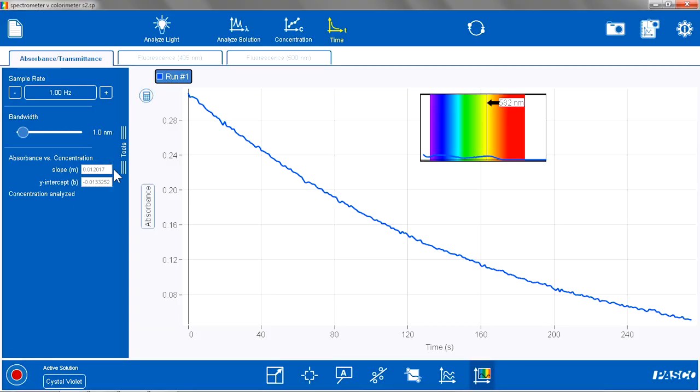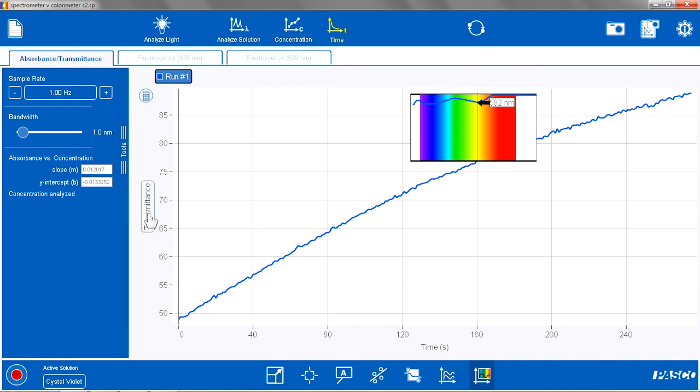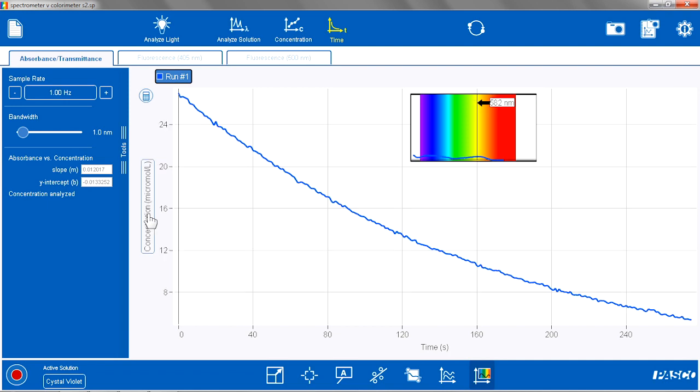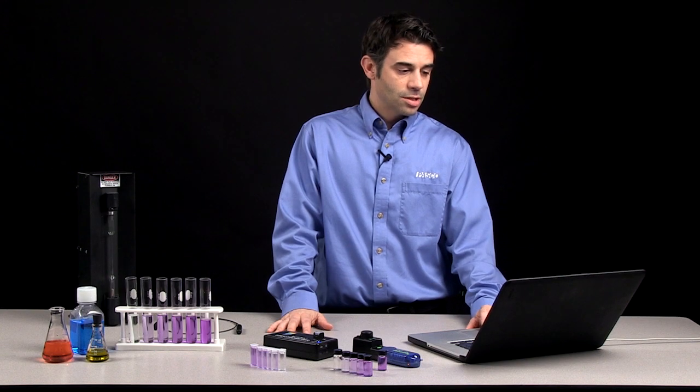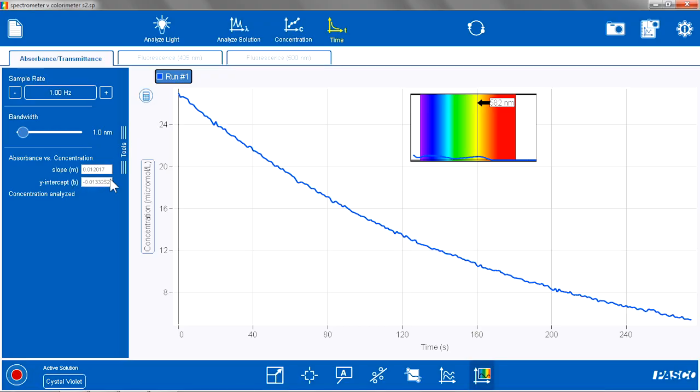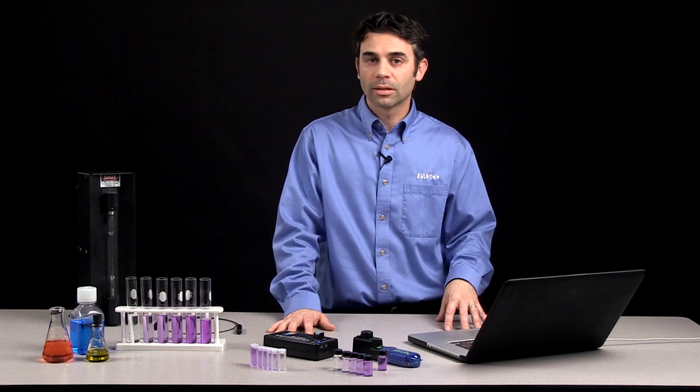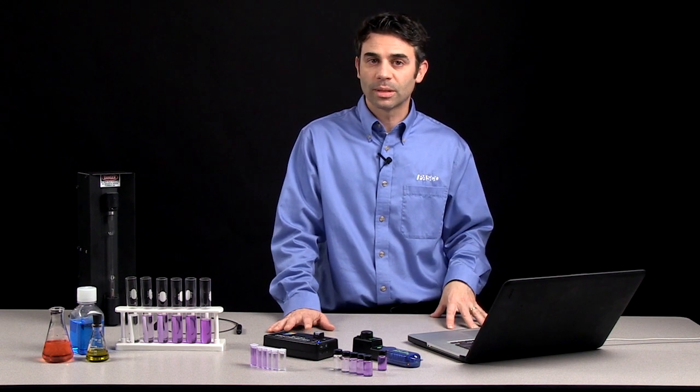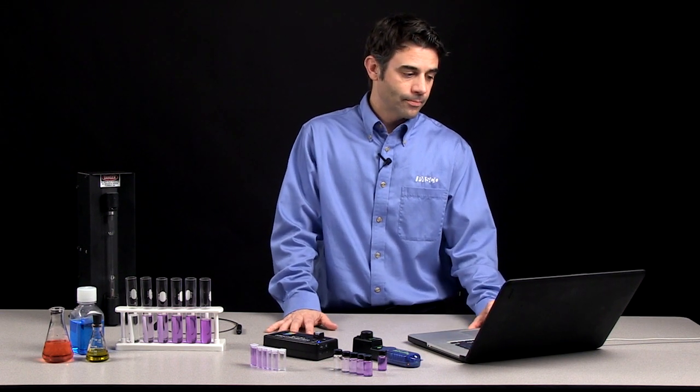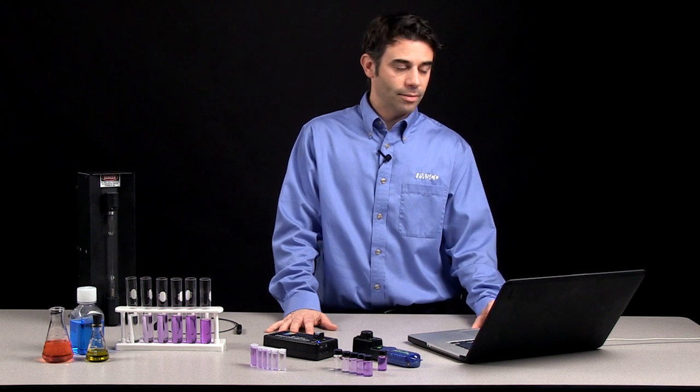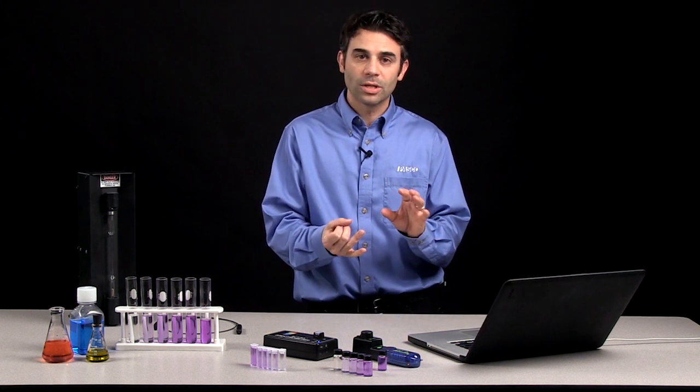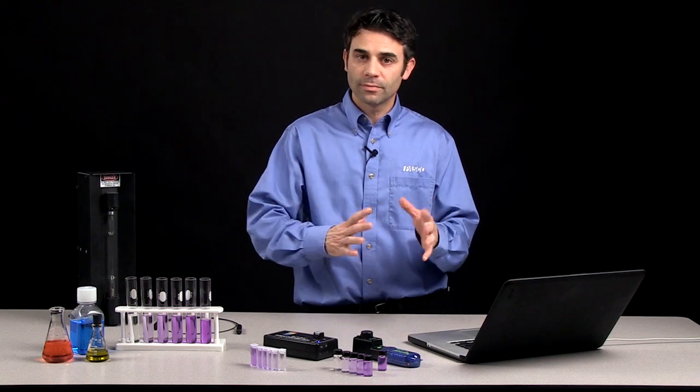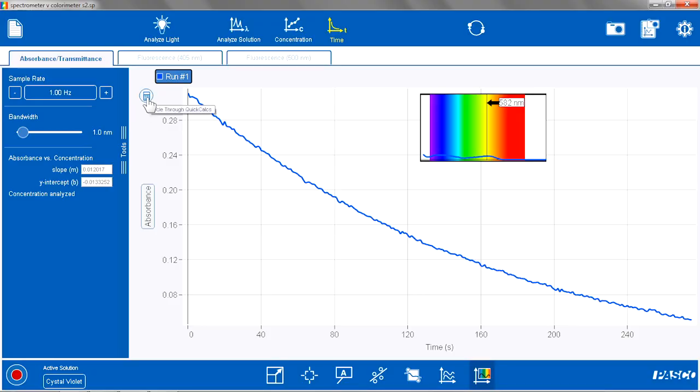The nice thing about the spectrometer is I could view this as absorbance versus time, easily as transmittance versus time, or as concentration versus time. And the reason I can do that is because the spectrometry software calculates the concentration based on the slope and intercept from that concentration experiment page. So now, once again, I want to be able to study or relate absorbance or concentration, natural log and inverse very easily. And the spectrometry software allows me to do that too.